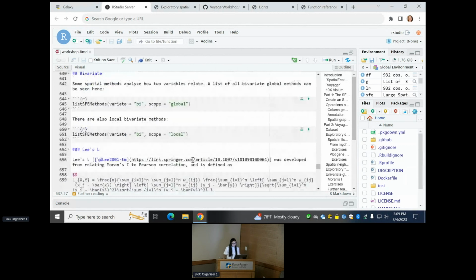All right, in spatial transcriptomics datasets, we can have hundreds of genes, usually for more targeted technologies, to thousands of genes of interest in Visium, and nobody wants to plot local Moran's I for all of the genes and inspect them one by one. Like nobody wants to do it. So that's why we have other spatial methods like bivariate and multivariate.